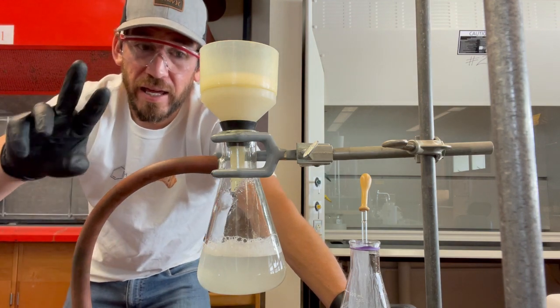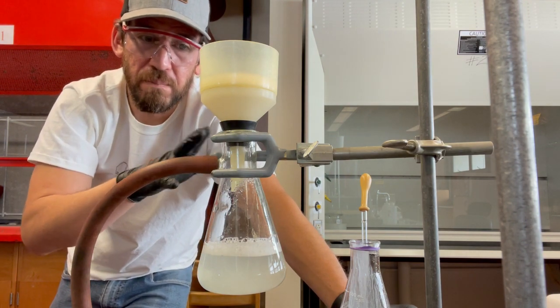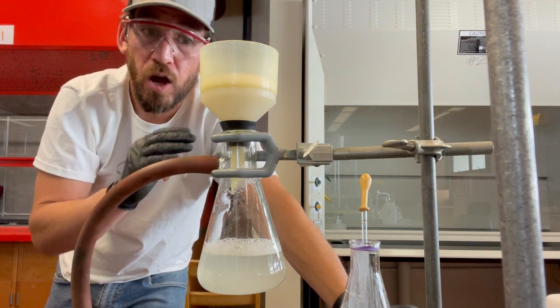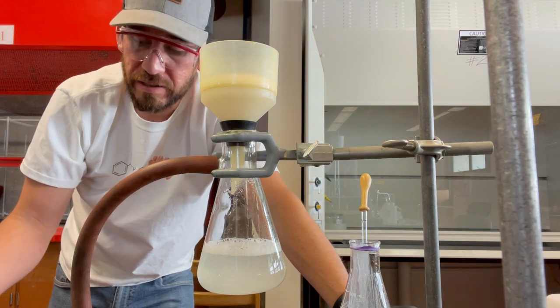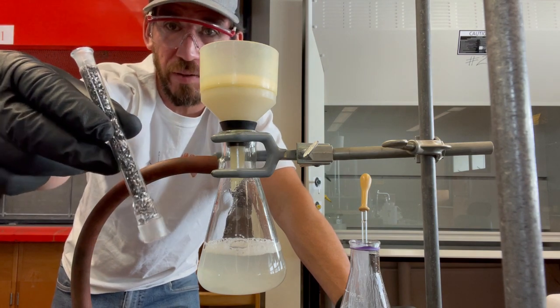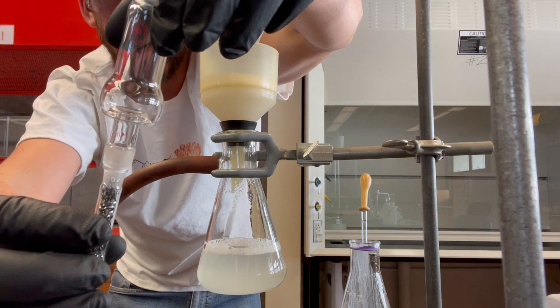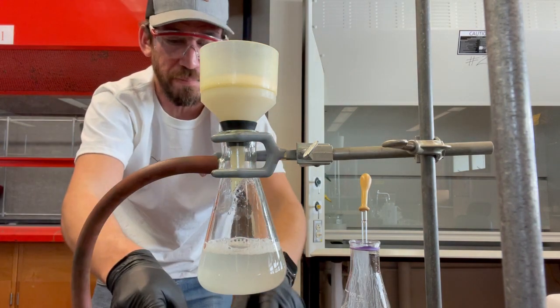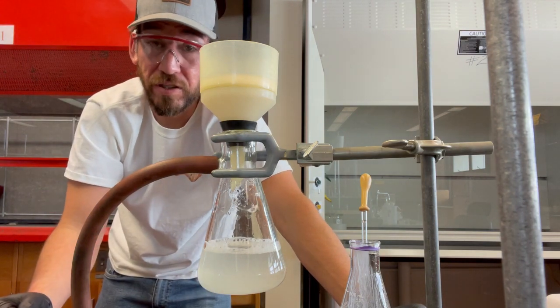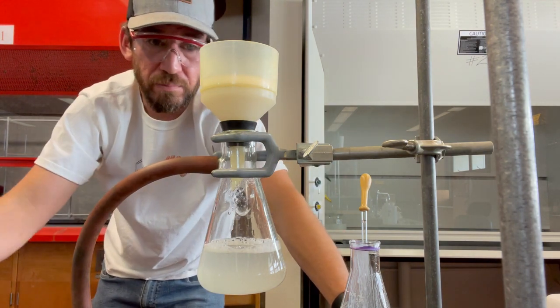Two reasons. I am going to measure the volume of this after I'm done. I haven't decided yet, I might do small scale fractional distillation, just for the sake of time, or I might do a large scale. I already made a fractionating column, but I'm looking for a piece of glassware to fit the top. So this is our little collection Hickman head. They don't go together, so super sad about that. I'm not sure I can actually make this guy work, so I might just have to do a big fractional distillation, but that's cool.